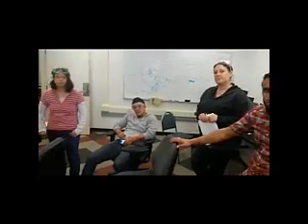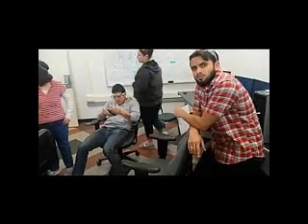So right now this is the best we can do, because we're still at Dominguez Hills. With the cloud technology, does the system have to be running for you to access it from home? The server will always be up and running. It's never going to shut down. Your data will be available 24 hours a day, 7 days a week, as long as the server doesn't shut down and it's on the cloud.